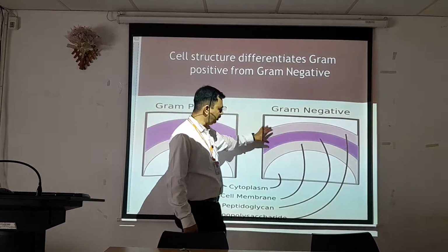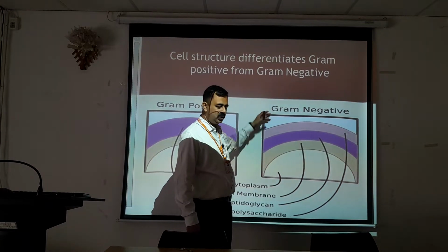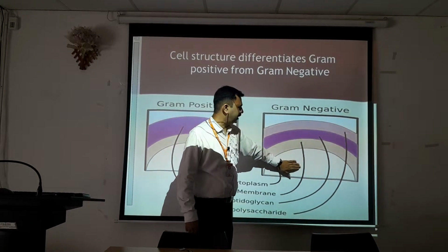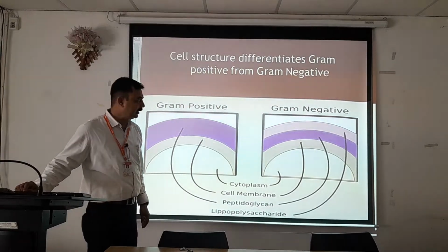लेकिन जब ग्राम नेगेटिव में आता है, ग्राम नेगेटिव का कैसा है लेयर देखो, छोटा सा लेयर है, so it can be easily dissolved with the help of a decolorizer, and the counter stain would come inside, and this original stain will go outside, and therefore it appears to be red in color.